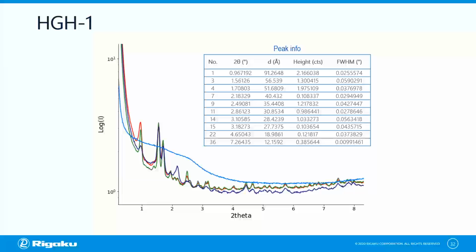And because we have this and we have the peak positions, then we can start to identify their crystal forms as well and extract information and perhaps start to manipulate these solutions to push them one way or another to a specific crystal condition or not.